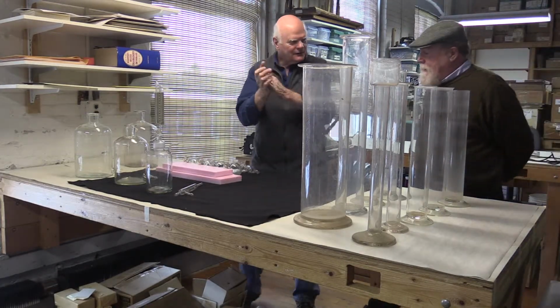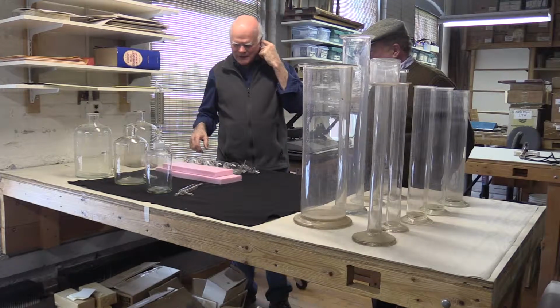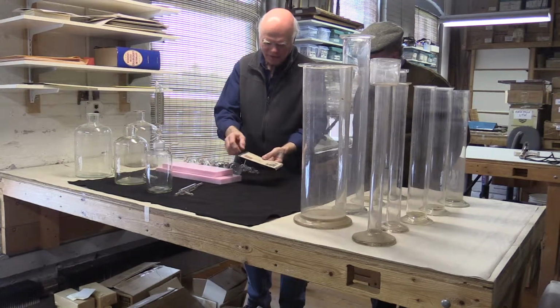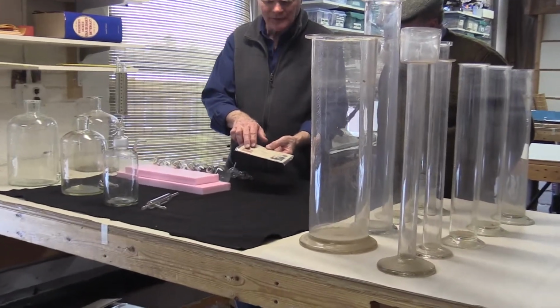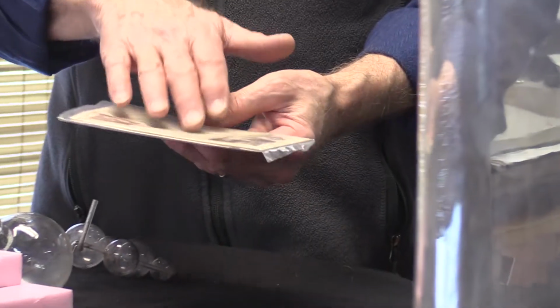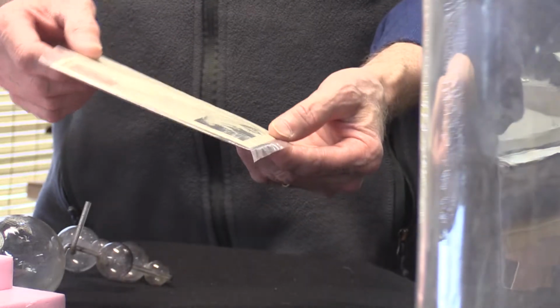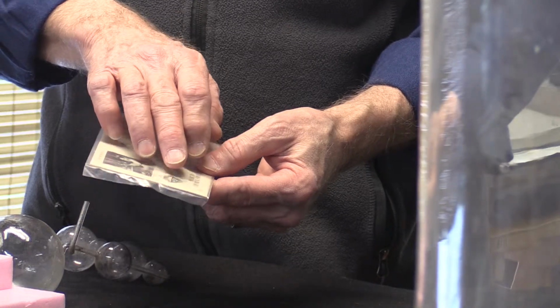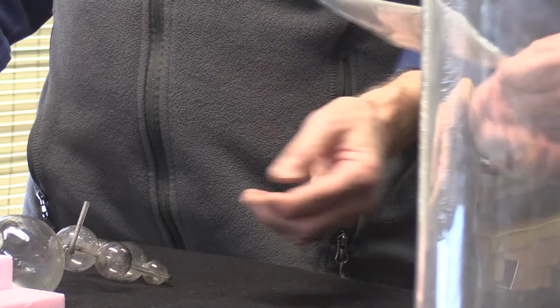Yeah, so there's something called the Kali apparat. It's German, developed by Liebig in the mid-1800s. It shows up, I mean, the camera's not going to be able to see this, but here's a first day issue of the American Chemical Society 75th anniversary of their organization, a stamp. And it happens to be the date that I was born, September 4th, 1951. So it was in the stars that I was going to be a chemist. And in the American Chemical Society logo, you see the Kali apparat, also known as a potash bulb.